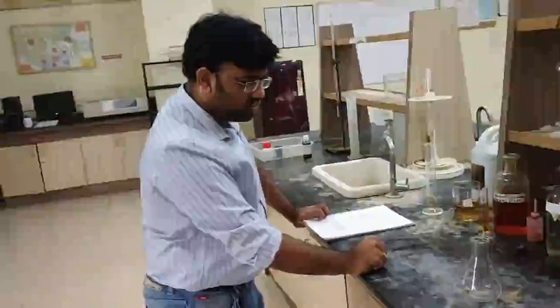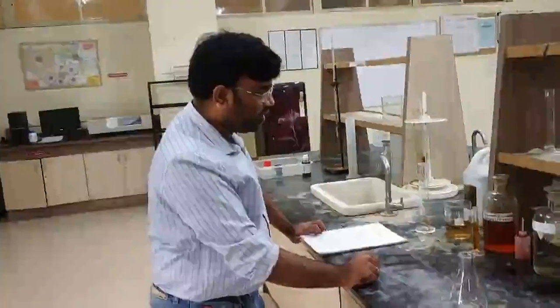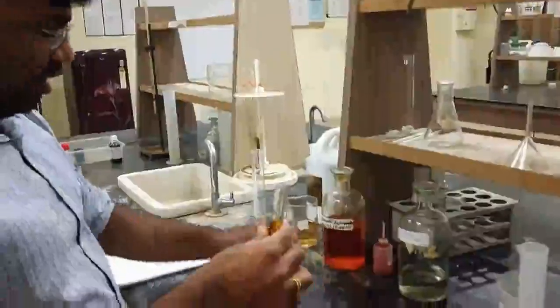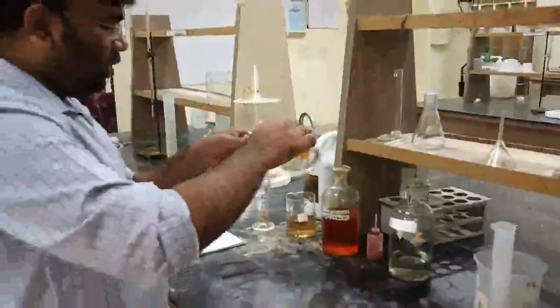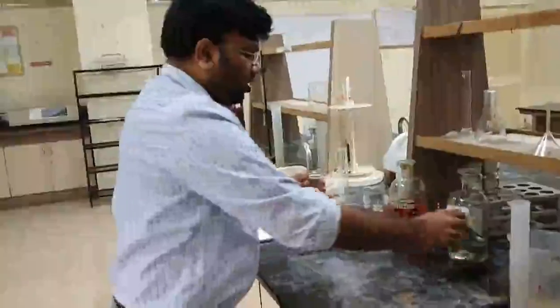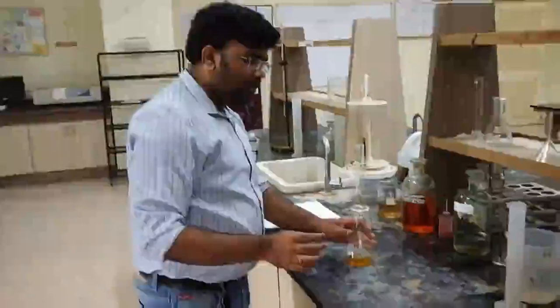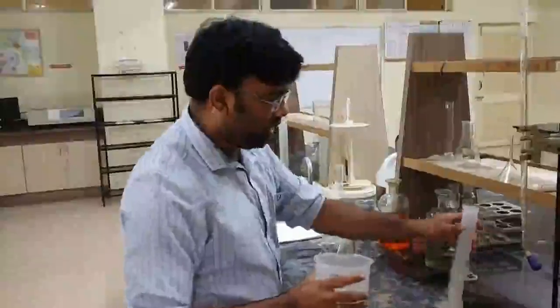The very first step according to the manual is to take 10 ml of 0.25 normal K2Cr2O7, that is, 0.25 normal potassium dichromate. I've measured 10 ml, and you can measure it via pipette or even your measuring cylinder. After that, we are going to add 100 ml of distilled water to it, right? So 100 ml of distilled water is to be added.